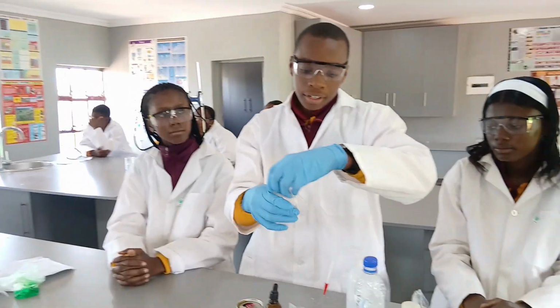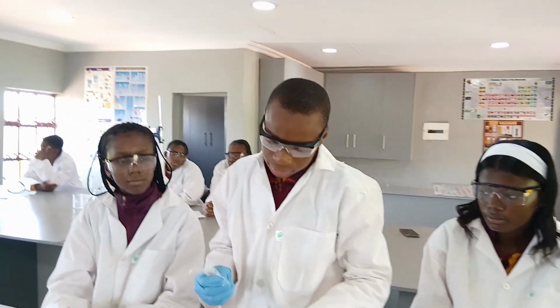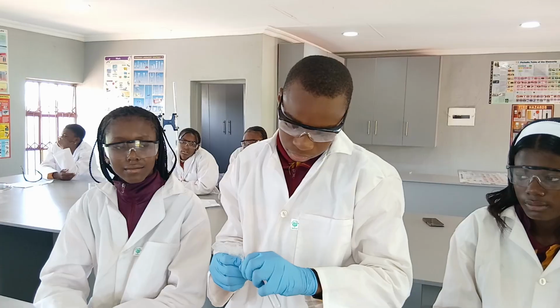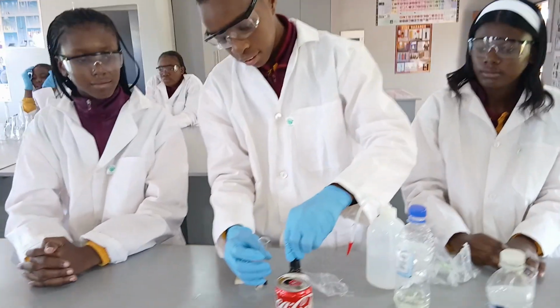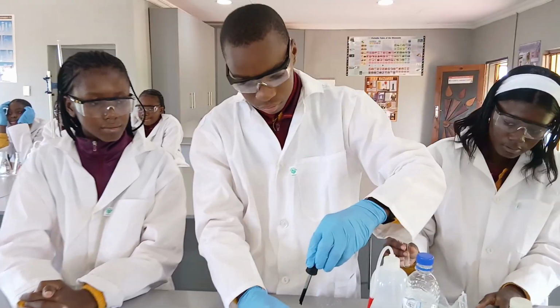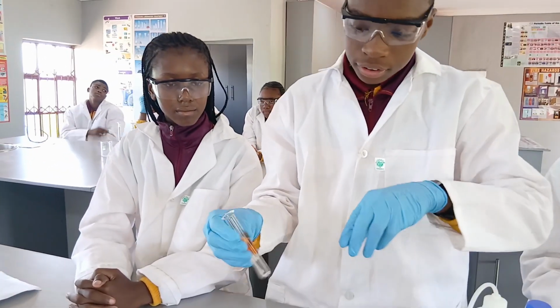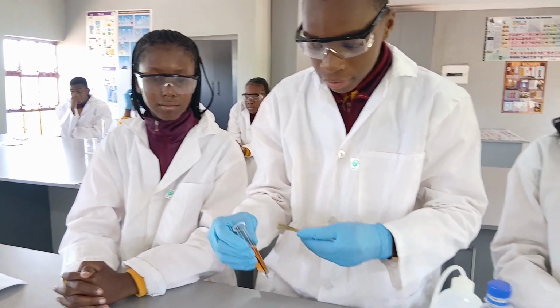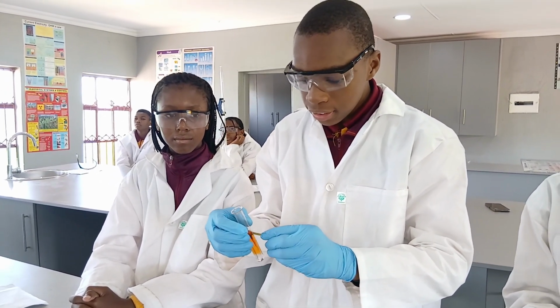Our last, this is our last sample, which is vinegar. So we want to check if it is an acid or base. We'll grab our universal indicator and we're going to pour 2 drops of it into this. Then we'll shake it so it can mix. We'll grab our pH scale and check. The color is orange, meaning that it has a value of 3, which means that this is an acid.